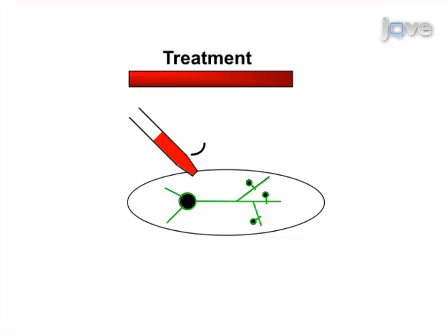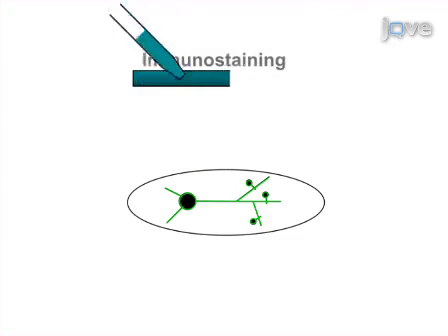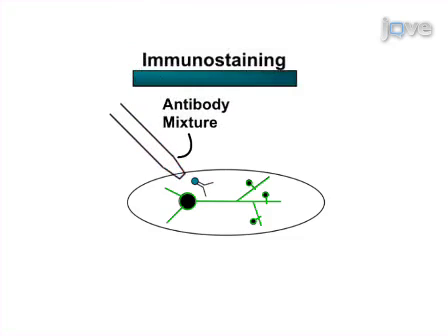In the second step, cells can be treated pharmacologically and subsequently fixed and immunostained, or prepared for time-lapse imaging and then pharmacological treatment, which will allow for the visualization of dendritic spines and the induced changes in dendritic spine morphology and motility.